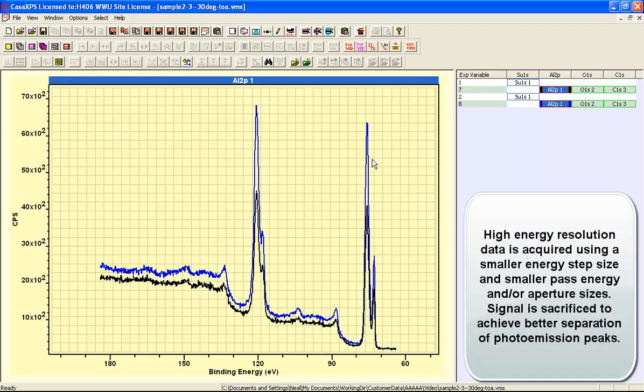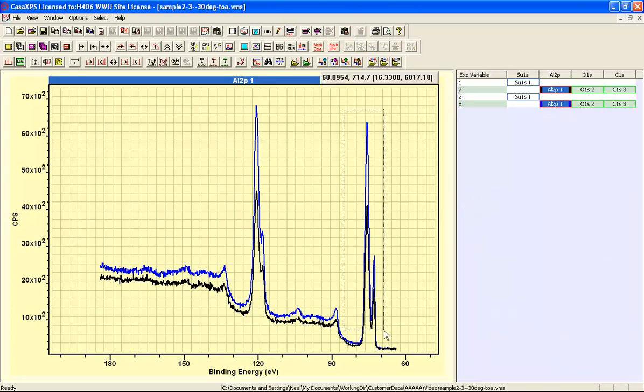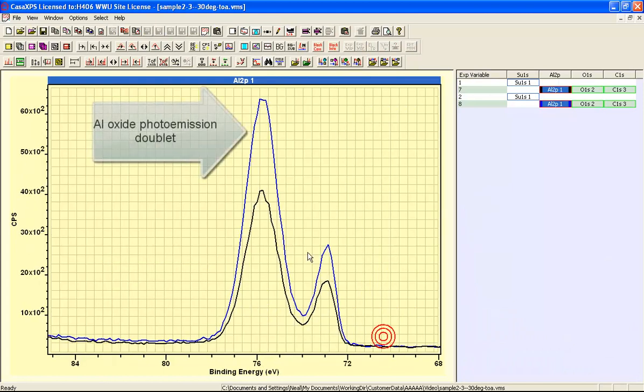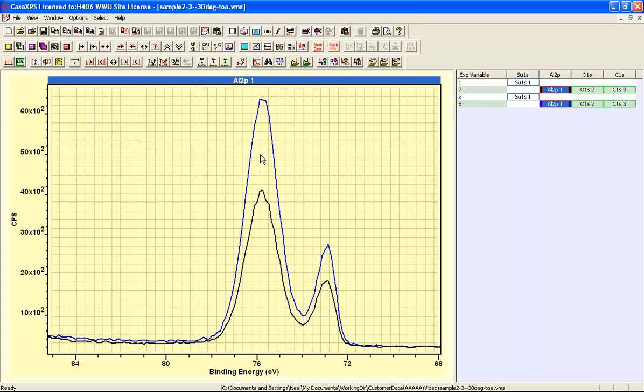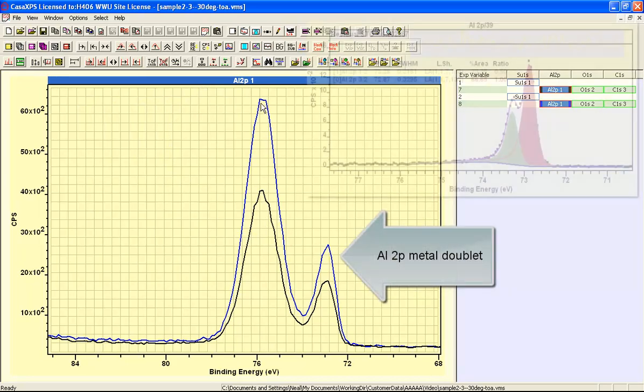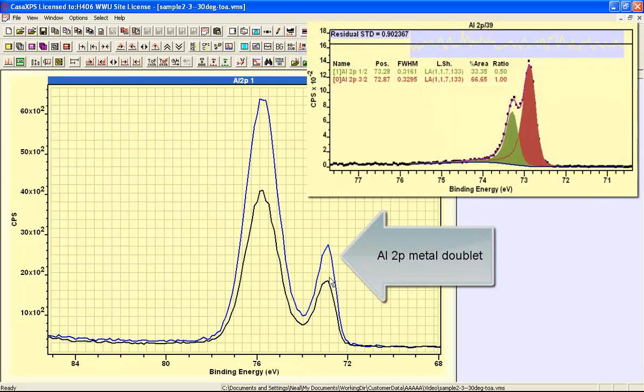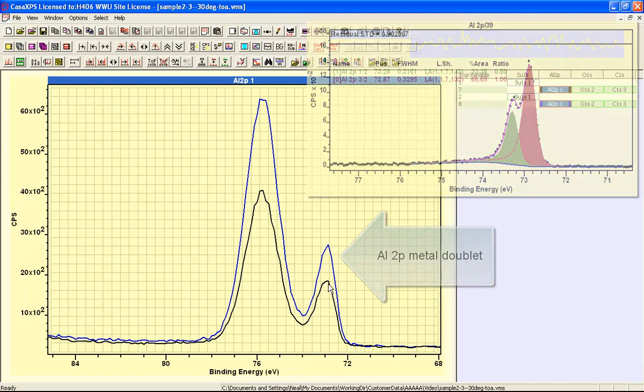When we display the aluminium 2P and the aluminium 2S, we can see clearly oxide and metal peaks within these data. This is the aluminium 2P where we can see a peak that is consistent with aluminium oxide and we also see peaks that are consistent with aluminium metal.